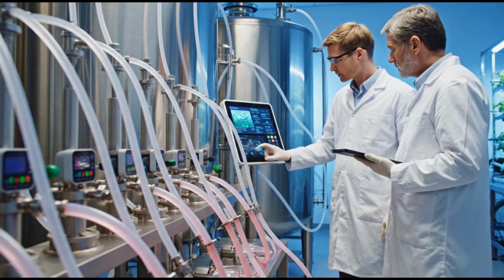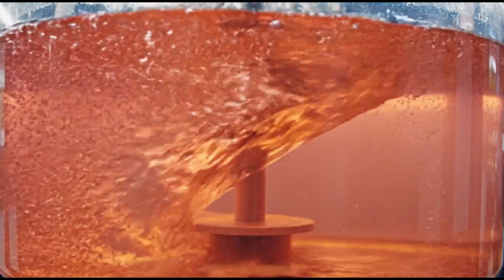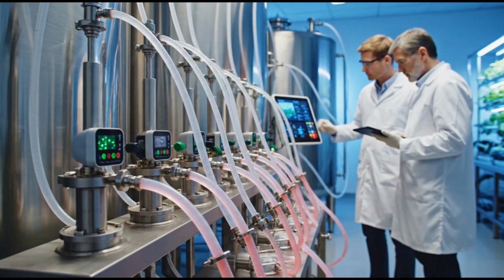Nutrient-delivery lines feed growing cells continuously. Automated pumps regulate flow without interruption. Close-up shows steady liquid movement inside tanks.